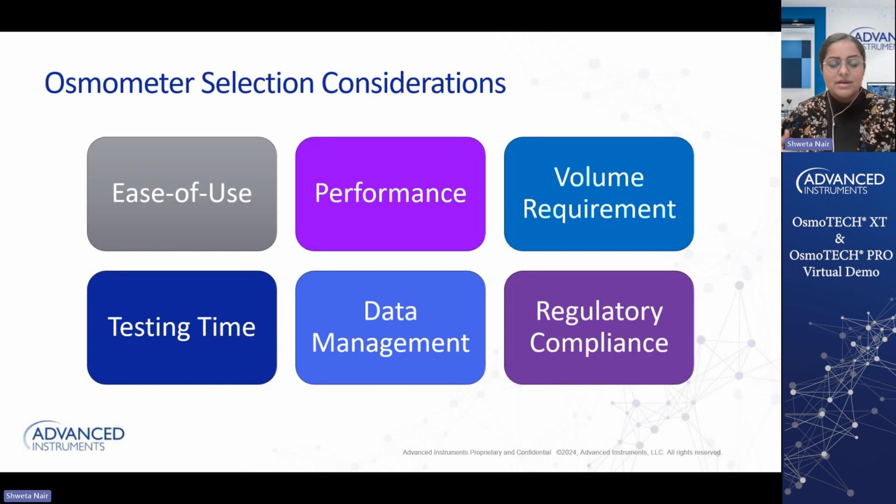Do we record them electronically? Can it be integrated into my ecosystem for data management? Will this instrument fit into my workflow in terms of regulatory compliance perspective, meeting the pharmacopoeia guidelines? Those are all different critical conditions and considerations that you may have when selecting an osmometer.